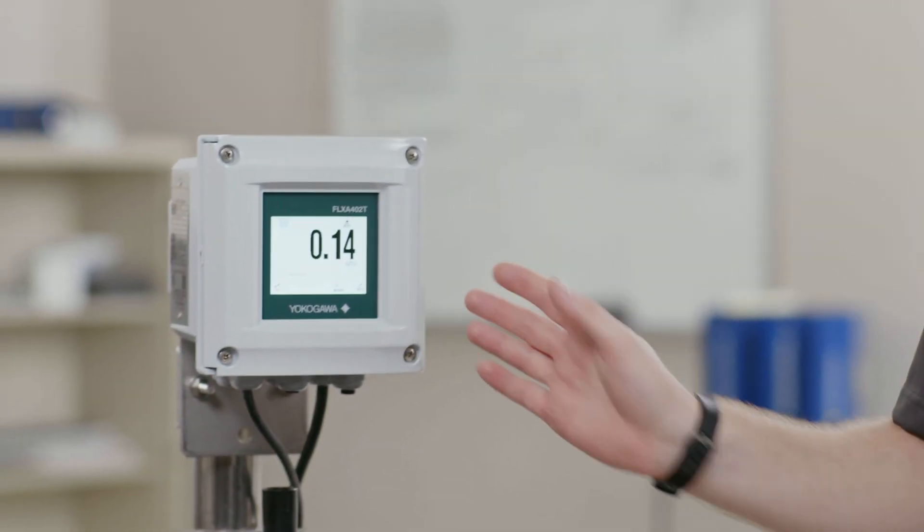Hello everyone, my name is Jared Heibart. I am a product manager here at Yokogawa and today I'll be covering how to calibrate your TB820D with your Flexa 402T.